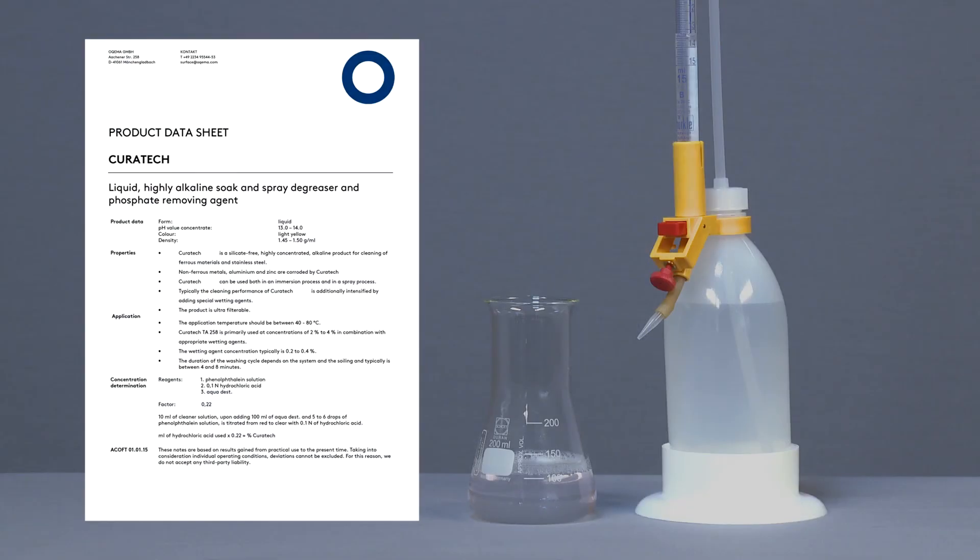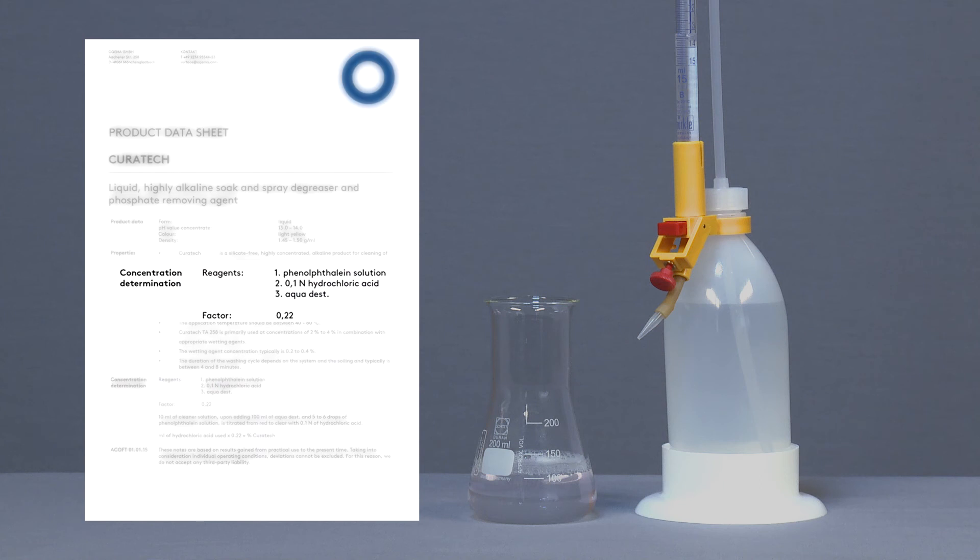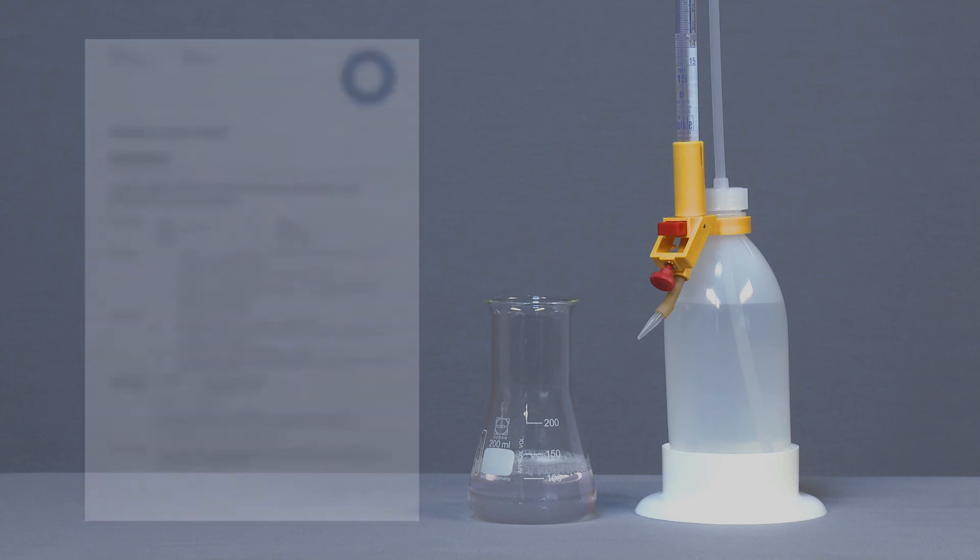Read off the consumed volume of the titration solution. In the last step, refer to the product datasheet. In addition to all important information about the use of the product, you can find the corresponding factor for concentration determination on there. Multiply the consumed amount of the titration solution in milliliters with the stated factor.